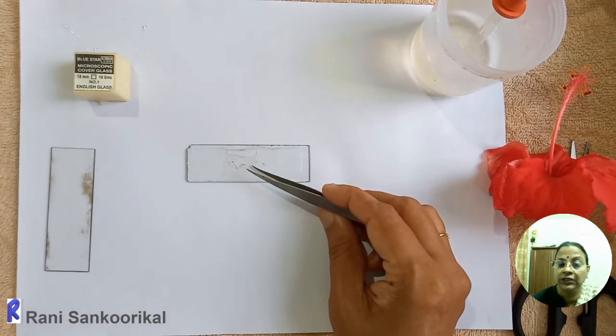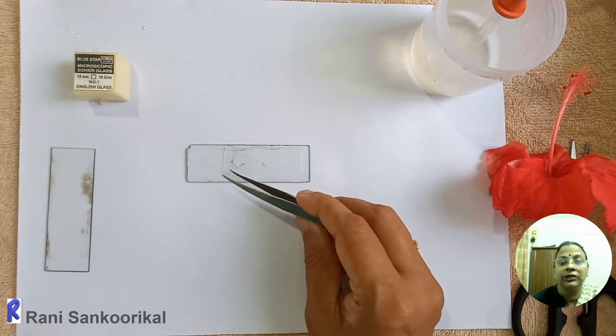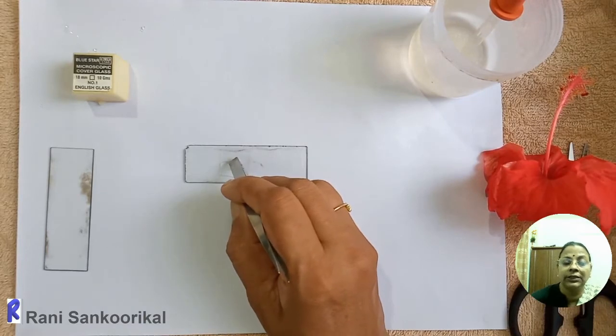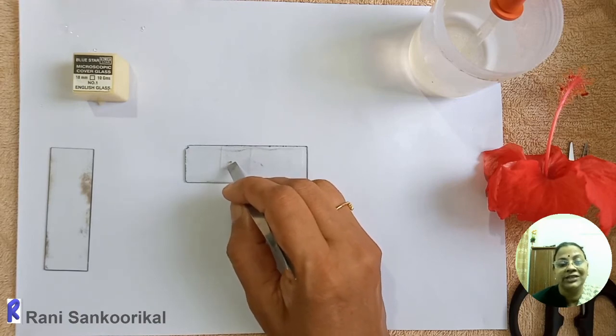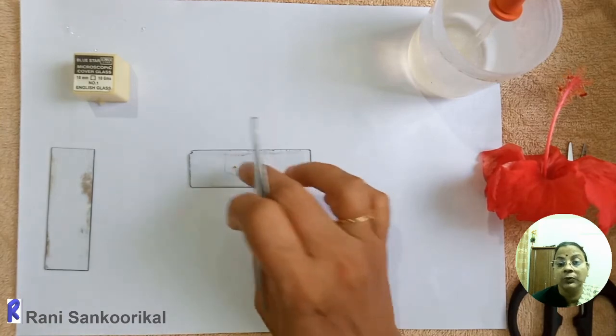Then with the base of the needle, or with a pencil or with your pen or with your finger itself, you slightly tap it onto the anther, so that anther will break and the pollen grains will come out. So gently you have to do, otherwise the slide cover slip will break.